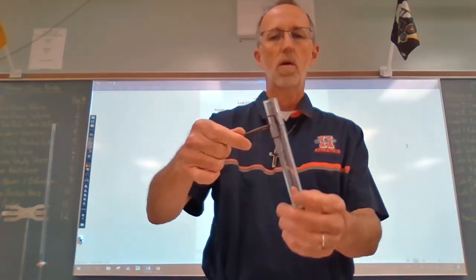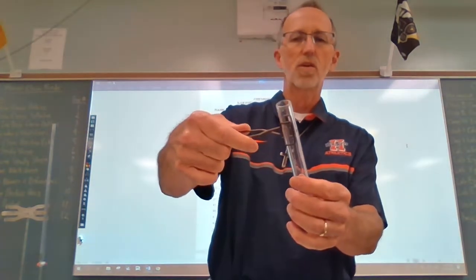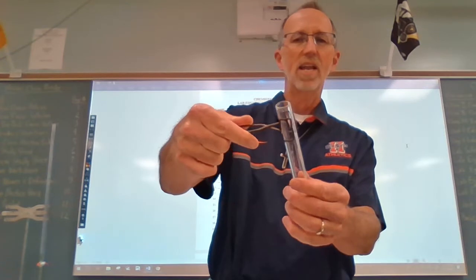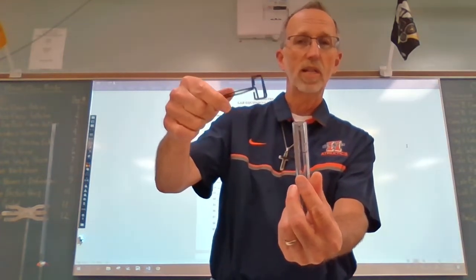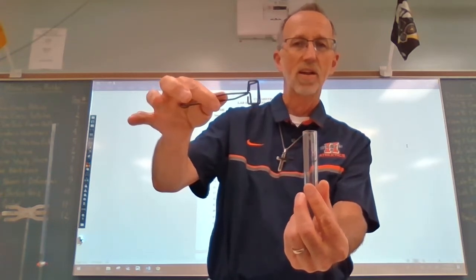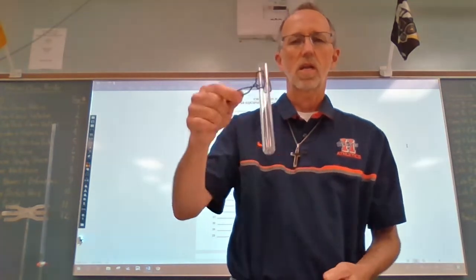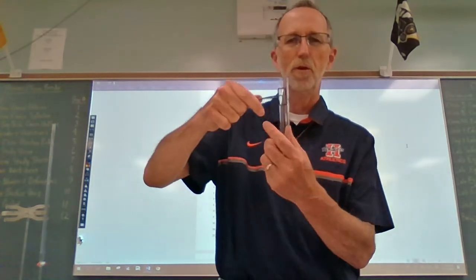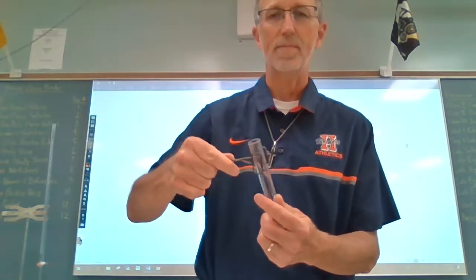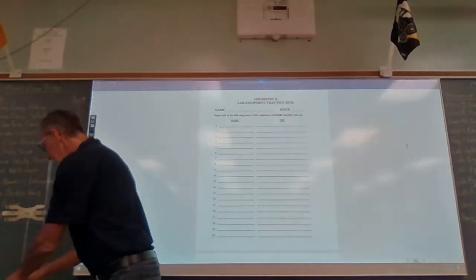Now, people get a little confused by this test tube holder the first time they use it. Notice if you depress the handle, that's when it lets go, and it's when you let go of the handle that it locks in. So kind of backwards, really. You don't want to pick this thing up and then press in like you would a pair of pliers. It works the opposite way. When you press in on them, it lets it go. It doesn't clamp down tighter. Okay, so that was 11 and 12.